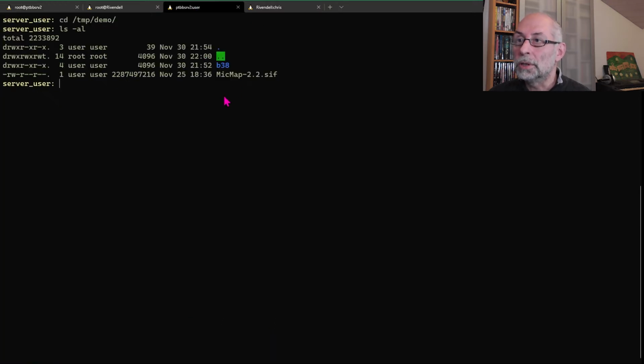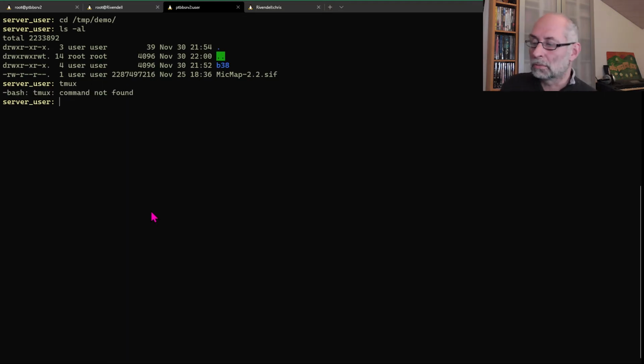So here in the other screen we can start then singularity. To make sure we are not interrupted in the middle of something, let's run, for example, tmux.